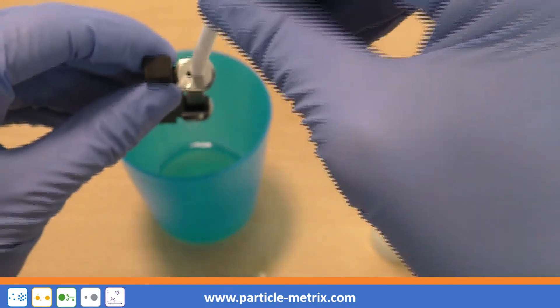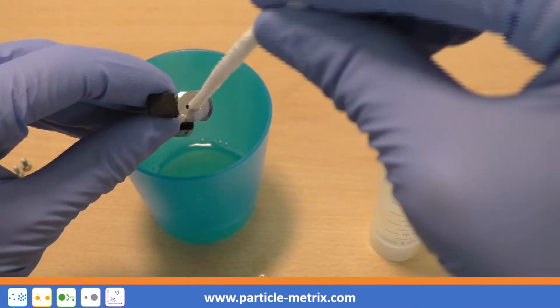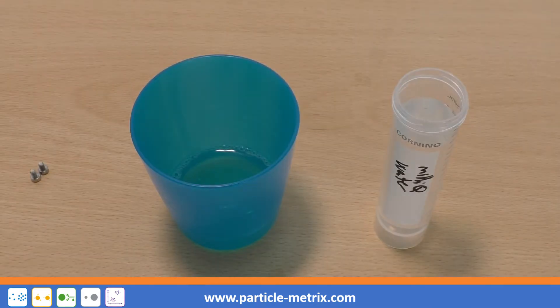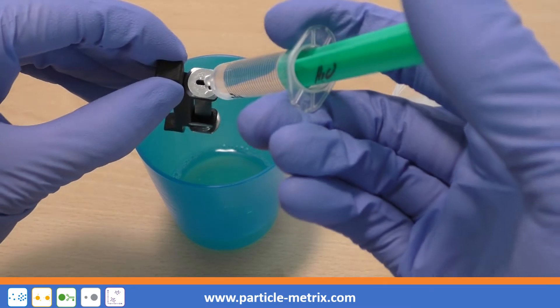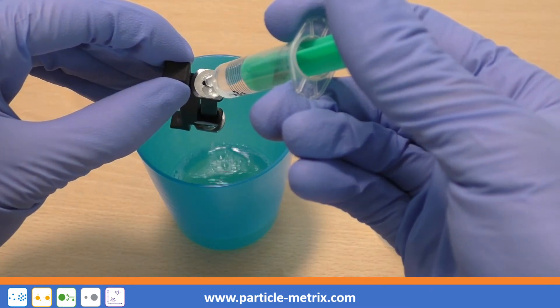When cleaning, be careful not to touch the cell's optical windows. Excess cleaning solution should be removed from the cell with particle-free water using a syringe or a wash bottle.